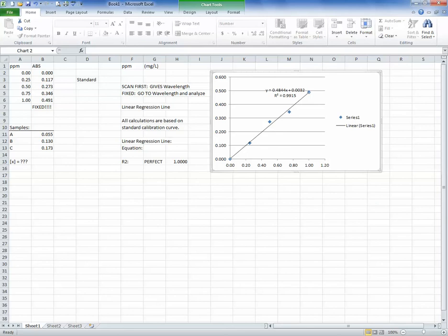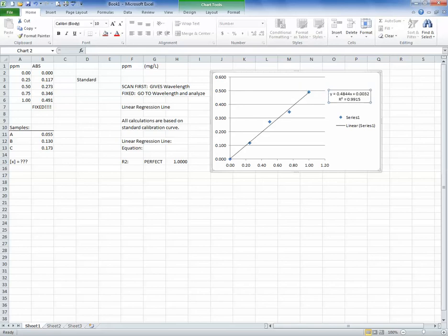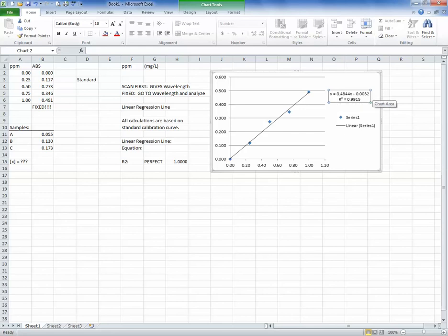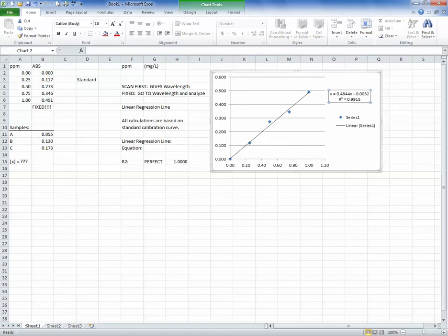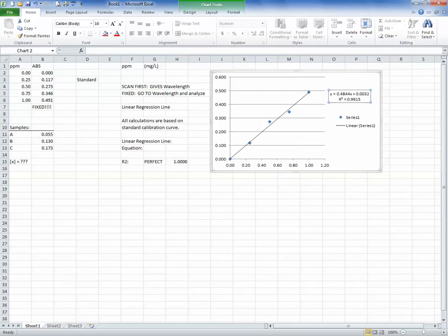So once I check those two boxes, I then close this box out. There's no really save, there's no apply button that I need to do. I just check them, and I hit close. And then if I look back on the graph, I now see that data that shows up right up here at the very top. So I'm just going to click that and drag it over, so maybe you can see it a little bit better. And it says y equals 0.4844x plus 0.0032. So that is my equation that I'm going to need eventually to solve for my samples. My r squared number tells me how close I was to a perfect line, and this is giving me 0.9915.